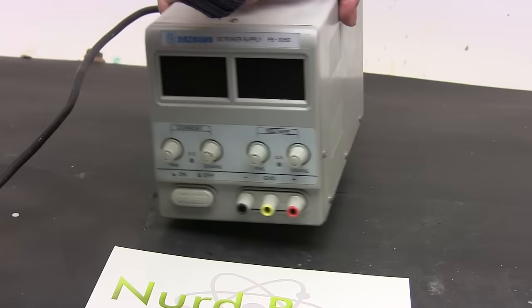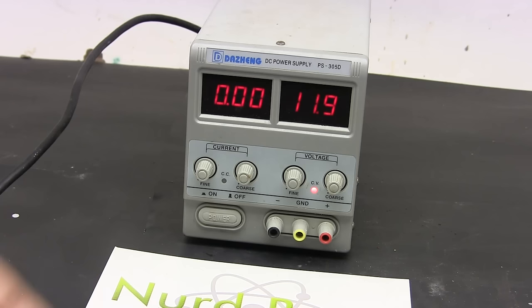Okay this is not a safety item but I'll put it in this video anyway. A good variable power supply is a must if you're doing any sort of electrochemistry. Batteries are too expensive if you're doing lots of electrochemical work and simple adapters only give you a constant voltage. A variable power supply is much more useful if you can get one that lets you control both maximum voltage and current.